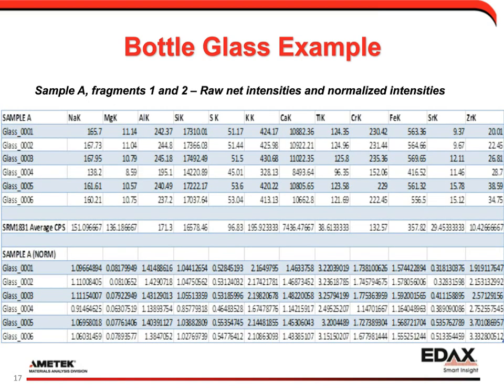Just to give an idea for one sample, not to crunch too many numbers on the slides here, on the top you have the raw intensities for all the elements, many of which were not used.